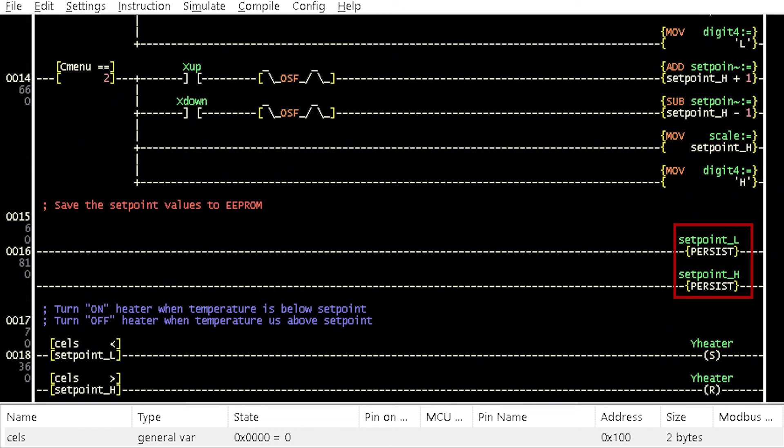The make persistent instruction from the instruction menu is used to store the lower and the higher setpoint to the EEPROM. The setpoints are automatically restored whenever the incubator is turned off and turned back on.